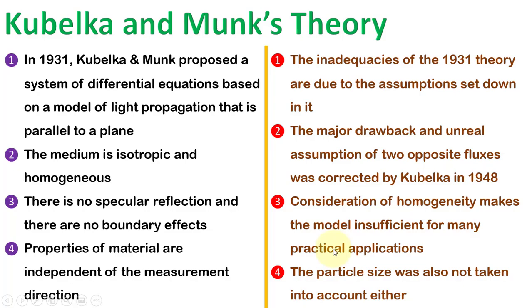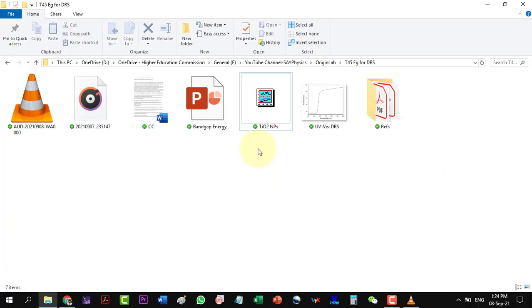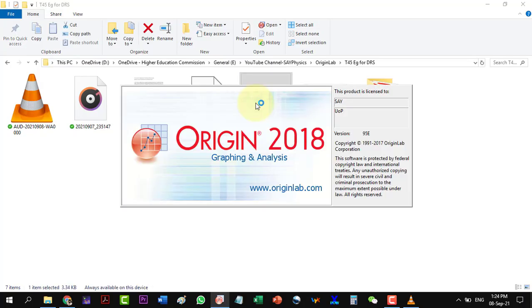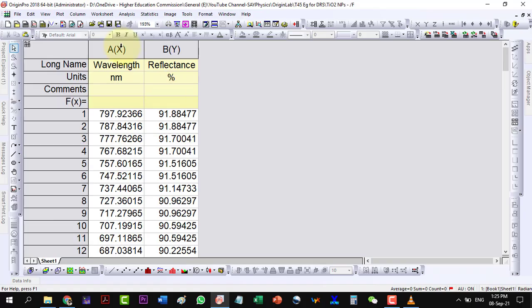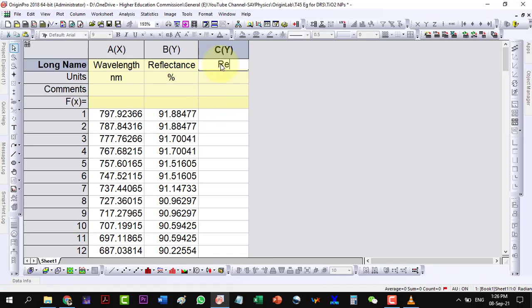Let us open the DRS data of titanium dioxide nanoparticles. The first column shows the wavelength in nanometer, while the second column shows the percent reflectance. The very first thing we should do here is to normalize the reflectance to 1 by dividing it by 100.